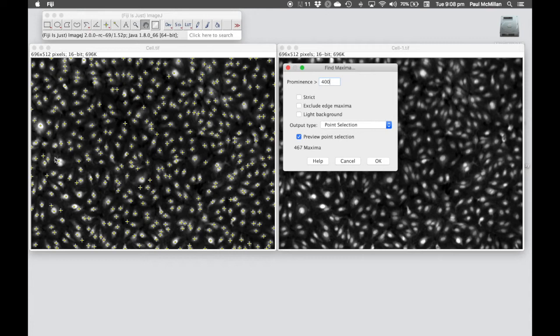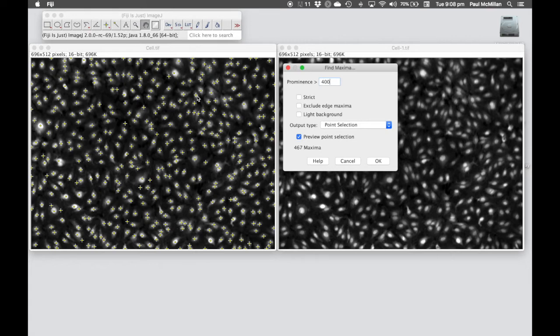The key thing about setting up this type of automated analysis is you will not get it 100% correct. For example, over here there's a couple of nuclei and there's only one point. If you can get it as close to 100% as possible, then that's probably about as well as you can do.